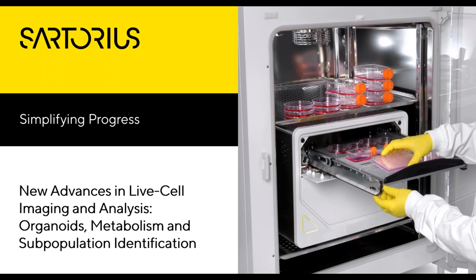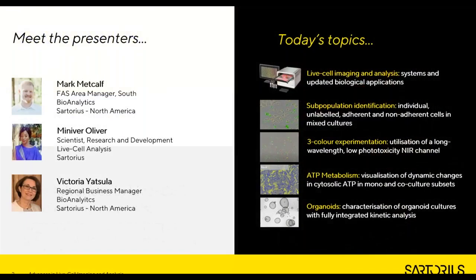If we can advance to the next slide, we selected several interesting topics for you today. We will start with the InQSight technology background, review techniques and methods for real-time analysis of cell health and function, subpopulation identification, looking at individual as well as adherent and non-adherent cells in mixed cultures, with examples of 3-color analysis.